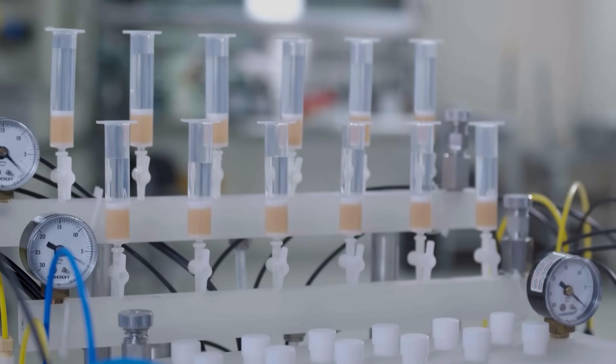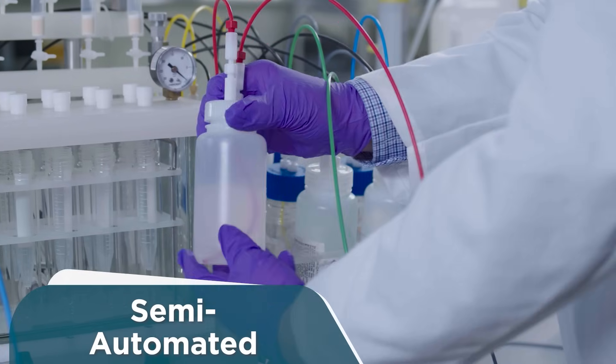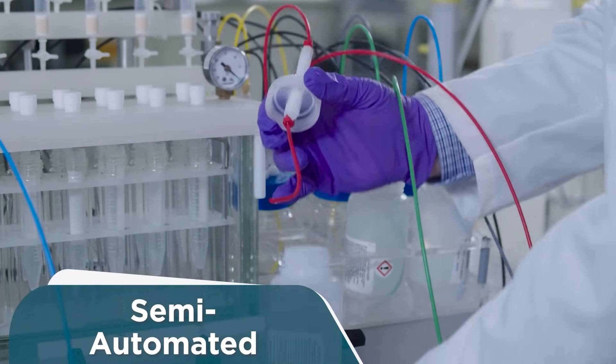EZPFC and SuperVap systems are easy to use and install. It is a semi-automated system. It hyphenates the entire solid phase extraction process.